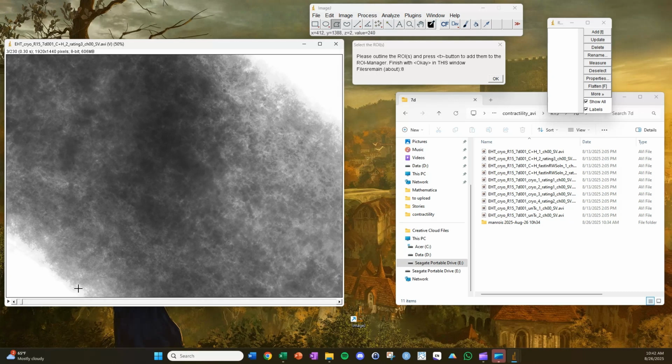Yeah, so I'm watching this thing kind of contract inwards, and I'm just going to try to pick that as the reference frame. So about there. So about there seems good.